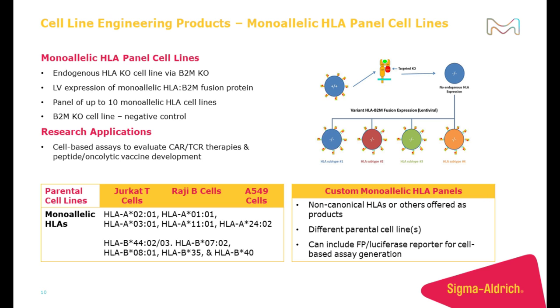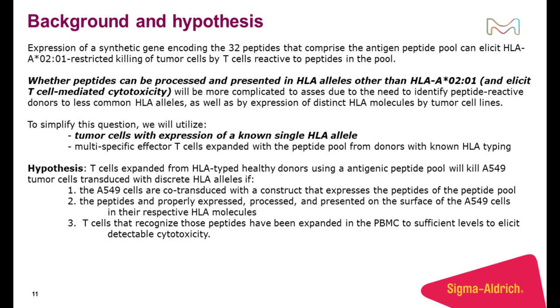So now that I've shown you some of these tools that we want to utilize and that we have created so that we can improve testing, I want to go through one application that we worked on with a collaborator as part of an early collaboration using specifically these HLA cell lines. The basic idea here is that our client had a suite of antigenic peptides that are known to be presented in the HLA complex.